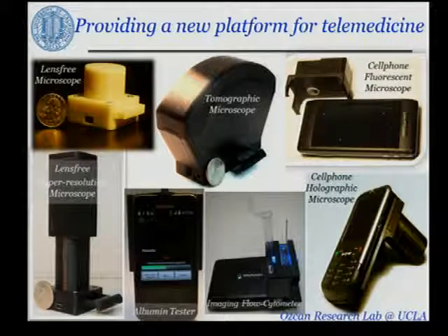In addition to mobile phones, you can also look at individual components, especially the CMOS chips borrowed from mobile phones, to create standalone designs. So these are microscopes that are based on CMOS imaging technology, 5, 10, 20 megapixel CMOS imagers, but they're working in a non-traditional imaging mode, and they can essentially generate large space bandwidth product images. For example, this microscope that you see here, without the use of any lenses, can look at about 1 billion useful pixels across a very large field of view, roughly half a centimeter by half a centimeter in area.